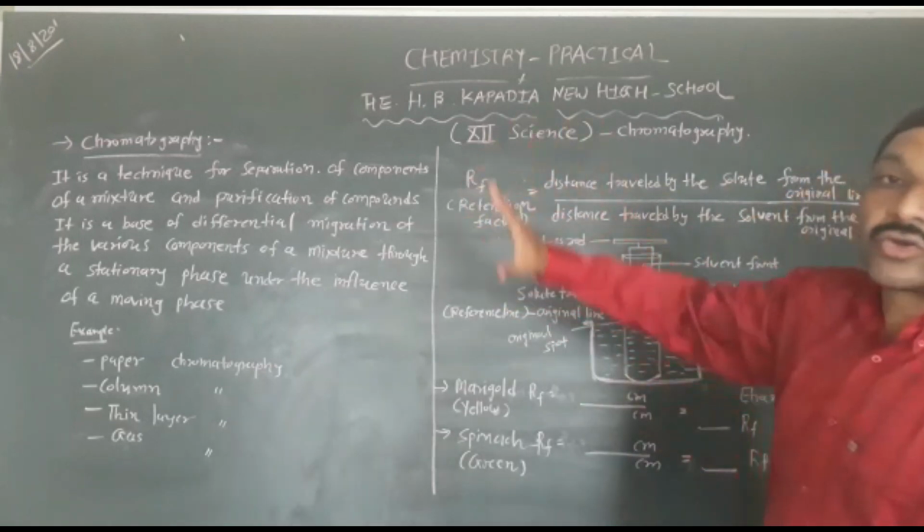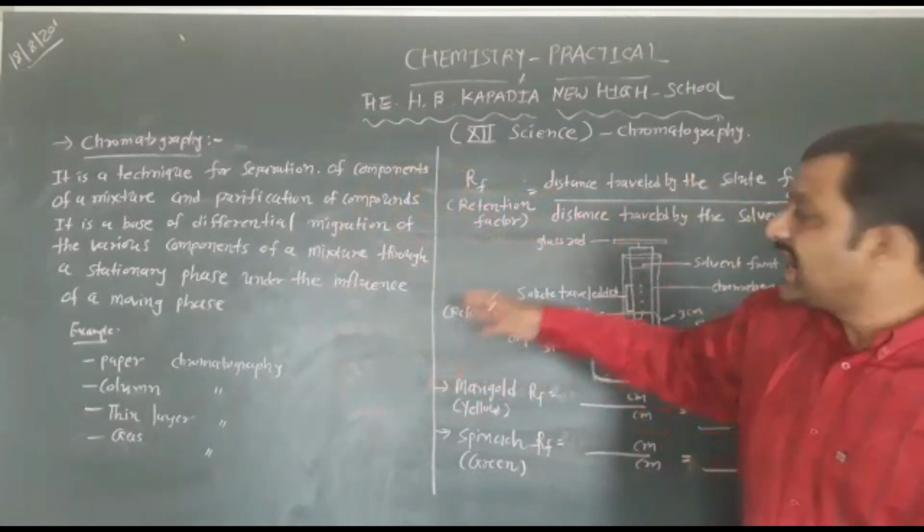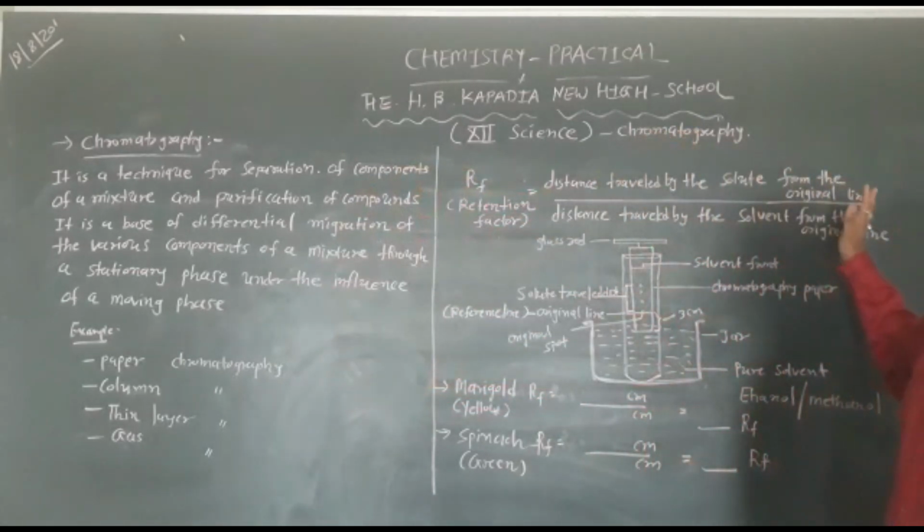So here is an example of chromatography and RF value.